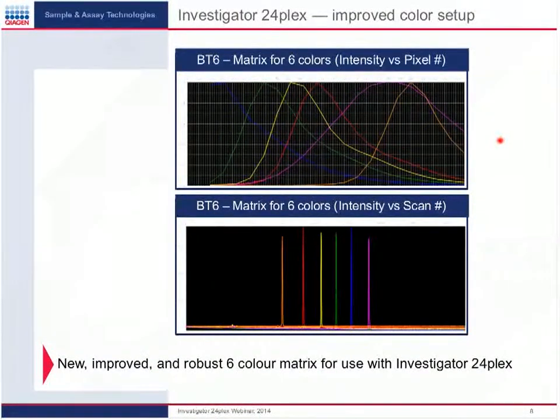And we were happy to find a new color that fits to the other colors with a very high intensity, and with this you also get a very high sensitivity. And this is also a good choice, as we had really low pull-ups between the different channels.